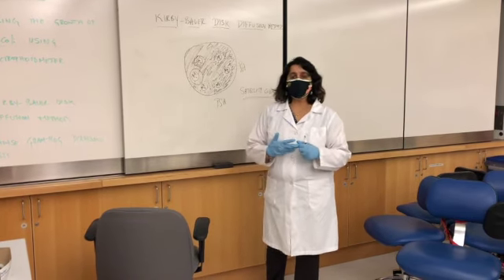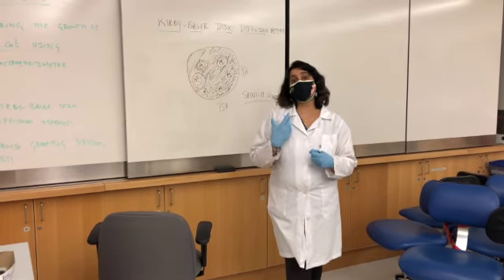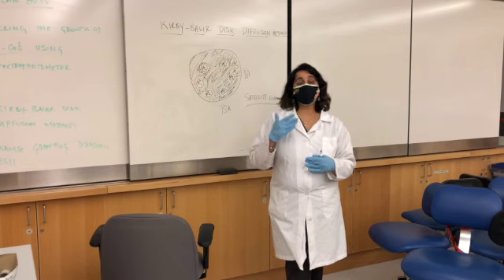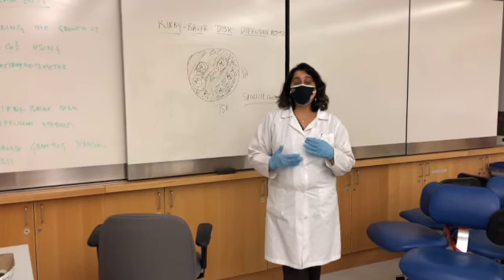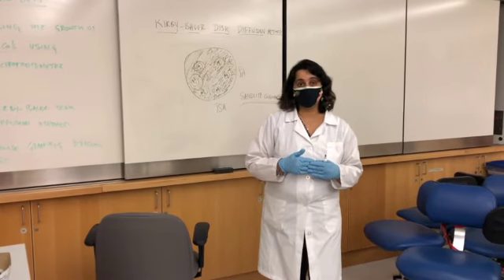So there are certain things that really help you come up with the specific or the good antibiotic for different patient samples. I'm going to upload that document on Canvas so you can easily understand how these Kirby-Bauer disc diffusion results are read in real case scenarios.